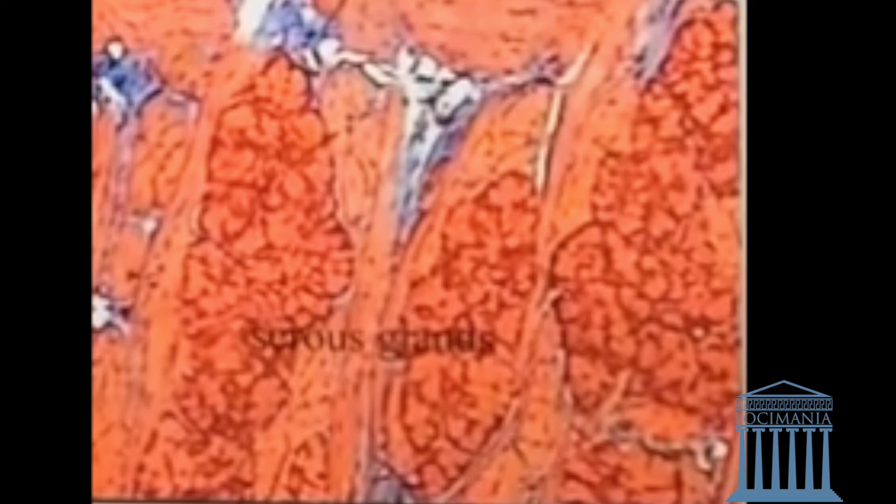Lastly, we're going to speak about the two types of glands. We have the serous glands and the light mucus glands. The serous glands are dark and red-colored, as we can see here — dark compared to the light mucus glands.